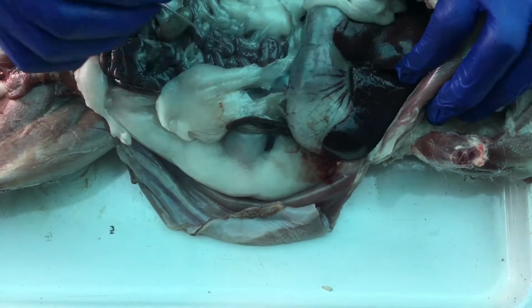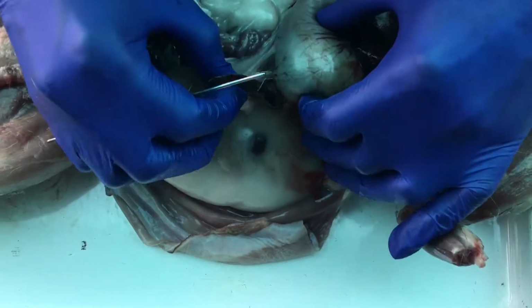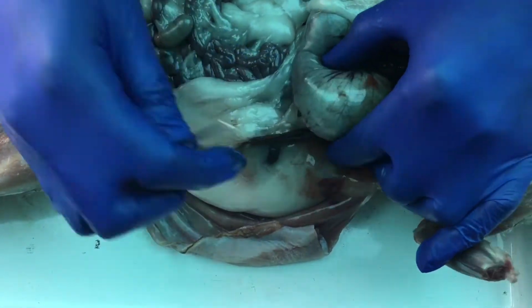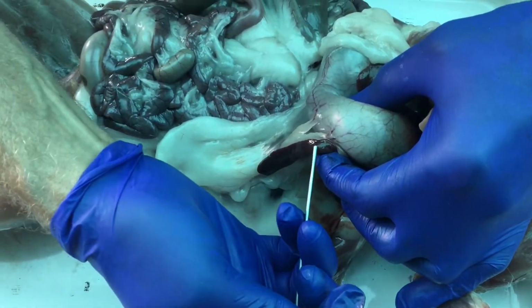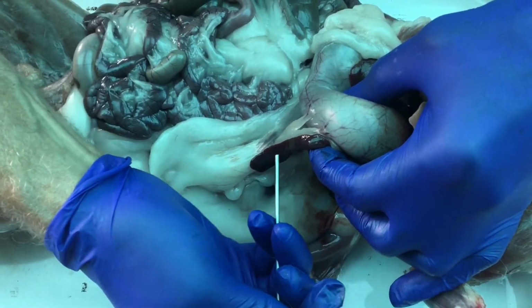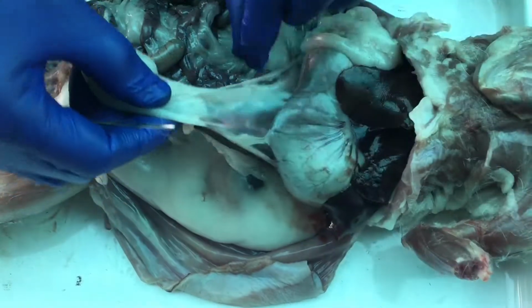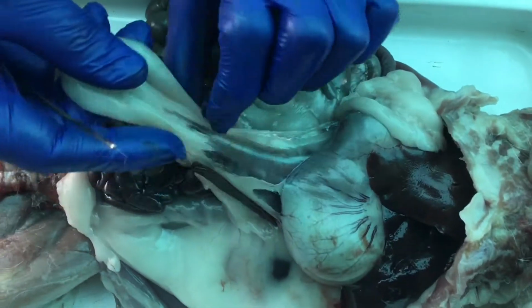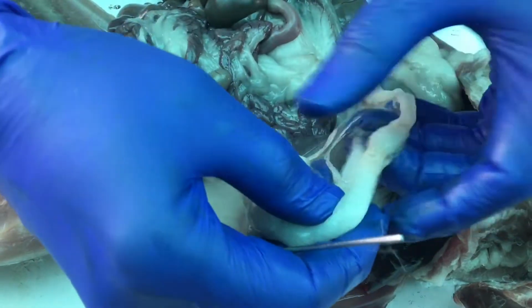So just to get oriented again in the abdominal cavity, there's the J of the stomach, the big liver, and just as an added bonus, along the greater curvature of the J, that's the spleen right there, which is a site where immune cells develop and are housed in the adult. And this big piece coming off of here would be what we call the greater omentum, a whole big piece of mesentery that drapes over the intestines. Isn't that beautiful how you can see that?